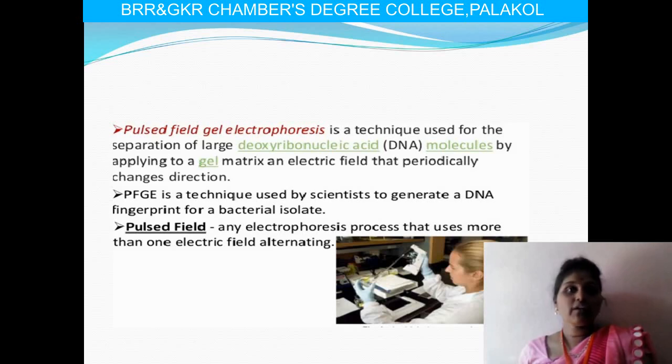If we have two fragments, one with a higher molecular size and the other with a lower molecular size, first when we apply the voltage the two molecules begin to separate. Then when we apply the high voltage, the smaller molecules take less time to move and the larger molecules take the most time. So during this, the separation occurs.